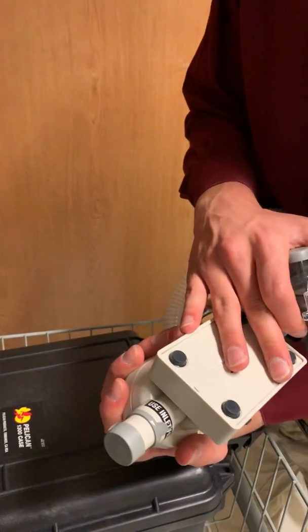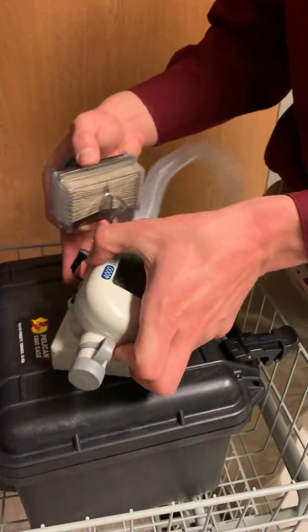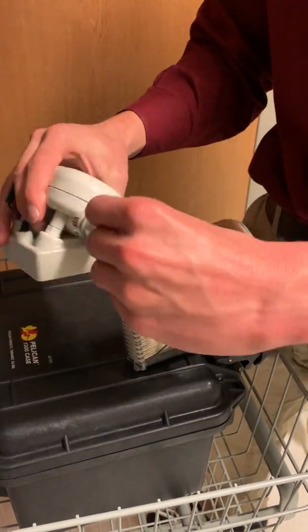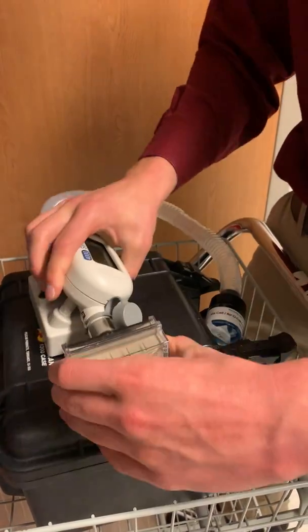You also have something called an inlet filter, and this is important. One of the sides actually says 'use inlet filter.' You can damage the calibrator if you put it on the wrong side. So we're going to take off the lid, take this off, and turn it on.